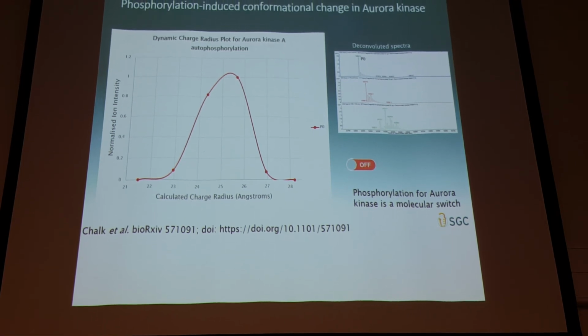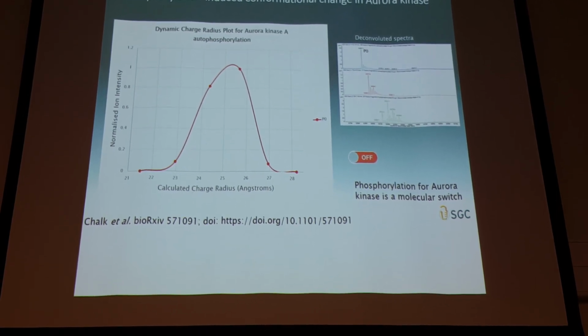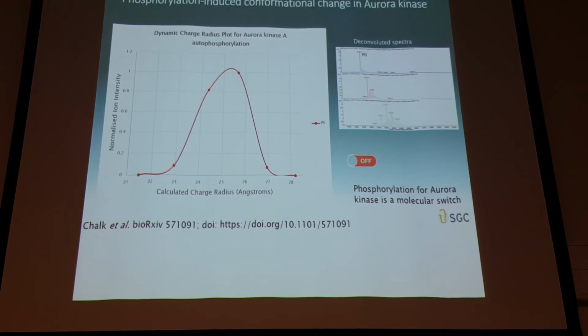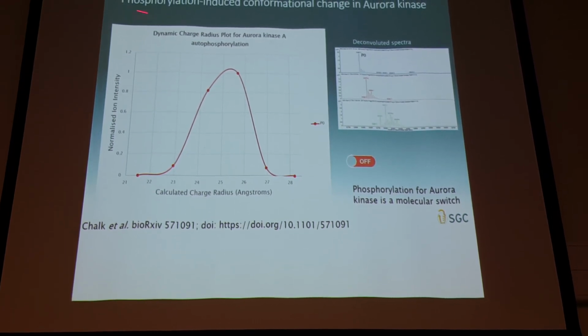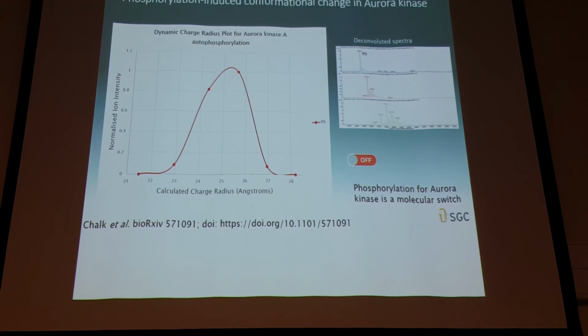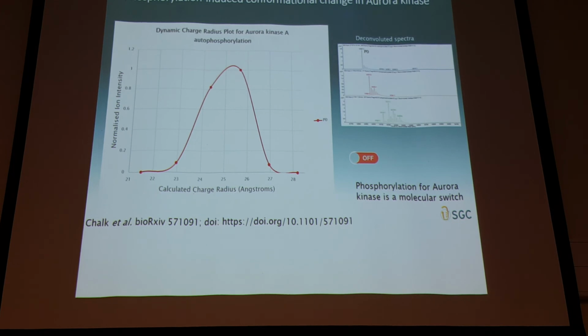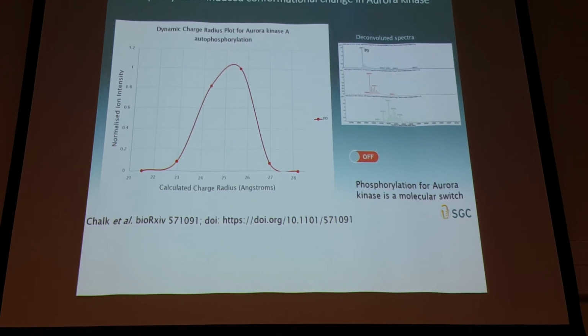Do elongated proteins behave very differently, rather than a globular, spherical one? You cannot do this calculation on a denatured protein. It's only valid on a native protein, and its validity is based on how globular it is.